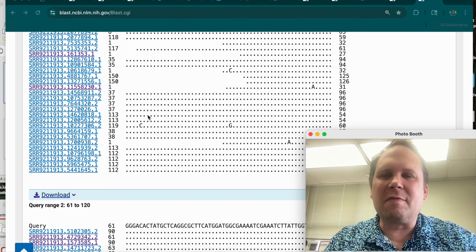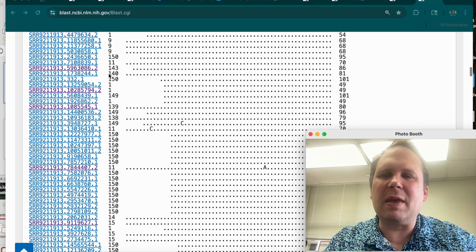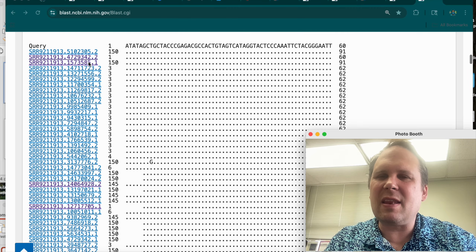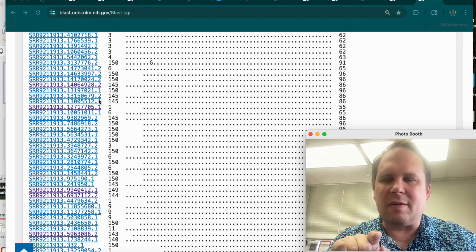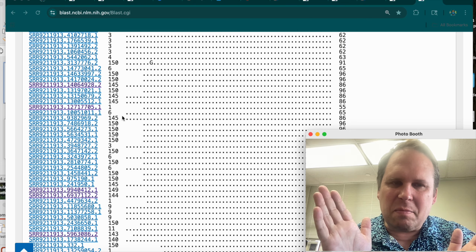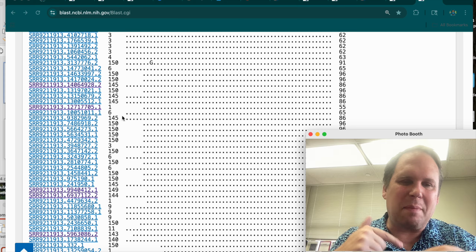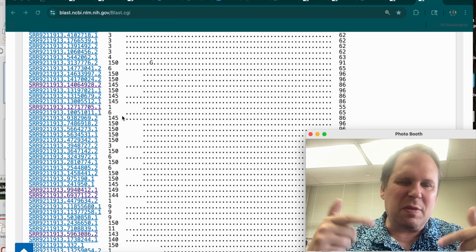So I'm finding reverse reads. A reverse read is going to have a big number here and a little number here, and it's going to match up to the beginning. So there's the beginning, and what we want to look for are different numbers. The way the databases are made, if they have the same number, it may actually be just another copy of the same fragment. Sometimes people make copies before they do the sequencing.